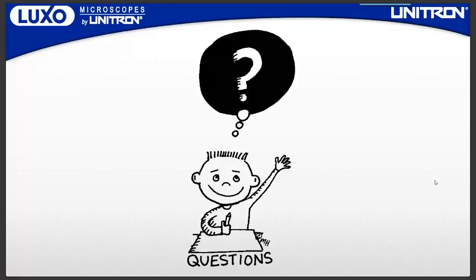Another question, I guess it seems logical, but can the Omni be controlled remotely? I guess someone might want to dial in and run the Omni. Maybe it's in a clean room or maybe for conferencing purposes. So it can't be controlled, but you can network it to access files. So you would log in through a PC and you can copy files from Omni to your PC. You can stream the live video.